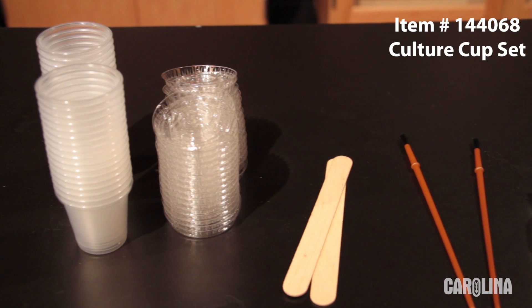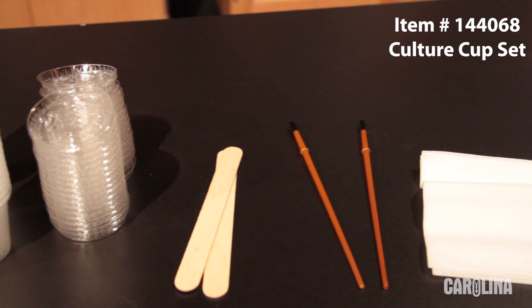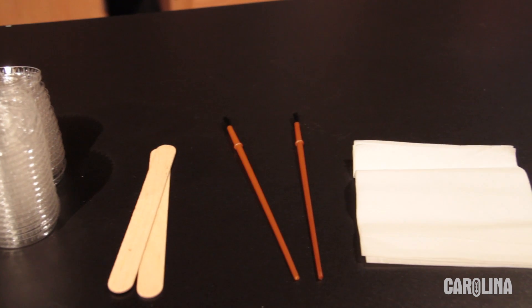You will also need a culture cup set, which consists of one-ounce cups, lids, tissues, spatulas, and paintbrushes to transfer your larvae.